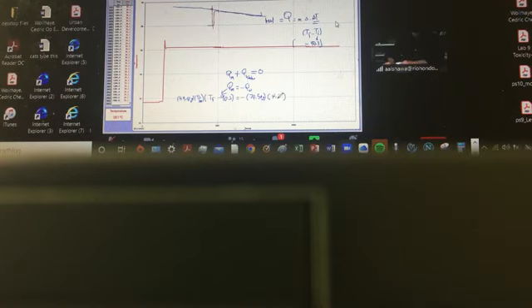So 4.184, and this is in joules per gram Celsius, times delta T for the water. All right, which is typically the final temperature, which is coming up, minus the initial temperature. And what was the initial temperature for the water?